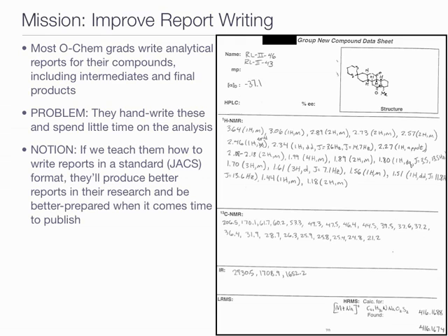There's this one lab, and this is less than a year old. So this is not ancient history, but this student prepared this molecule, and the boss has them fill out this form this way, and they write out their entire spectrum like this, and then they draw a little structure. This is time consuming, and it's not something that can be propagated except by a photocopier.